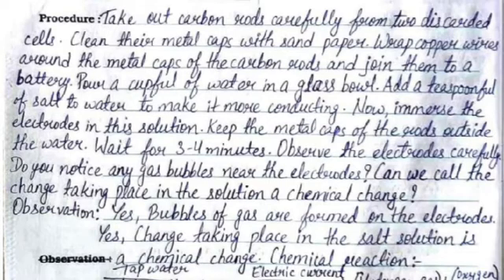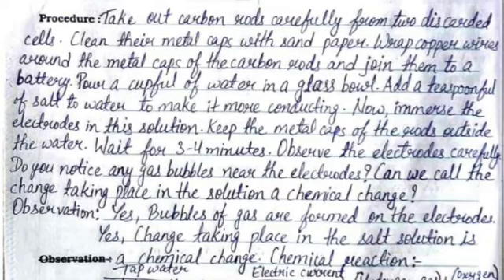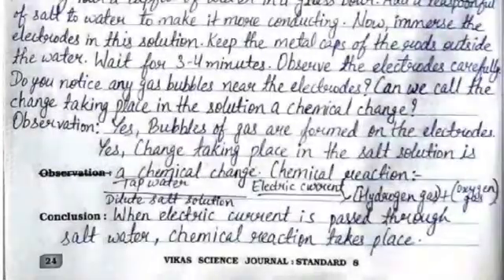Now immerse the electrodes in this solution, keeping the metal caps of the rods outside the water. Wait for three to four minutes and observe the electrodes carefully. Do you notice any gas bubbles near the electrodes? Can we call the change taking place in the solution a chemical change?